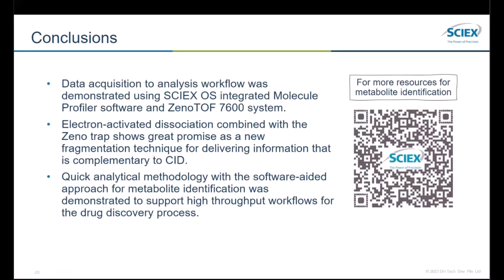Electron activated dissociation, as we discussed, combined with the Zeno trap, definitely shows great promise as a new fragmentation technique for delivering information that is definitely complementary to CID. A quick analytical methodology with just 6.5 minutes with a software-aided approach for metabolite identification was demonstrated to support high throughput workflows for the drug discovery process.